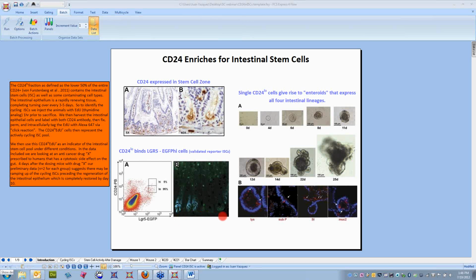We did find that the cells grew in clonal analysis. You can see here at day 0 single cells, and you can see them progress and form these enterospheres, which are multicellular spheres that have a lumen in the center, replicating somewhat of a mini-gut. Crypts begin to bud out by day 14 all the way to day 25, and they become these multilobular structures we call enteroids.